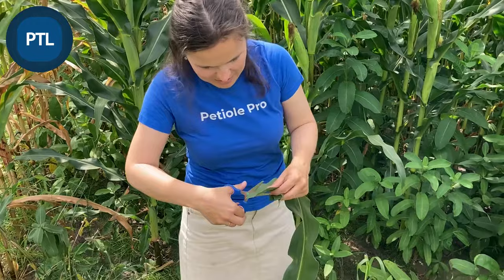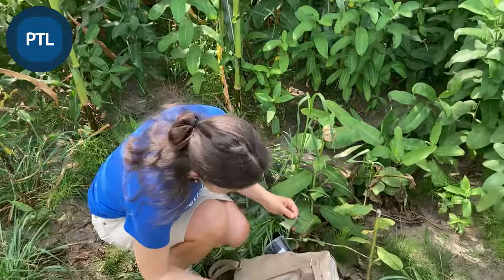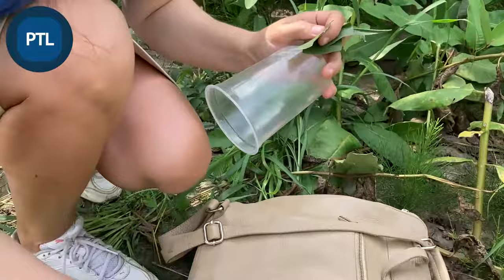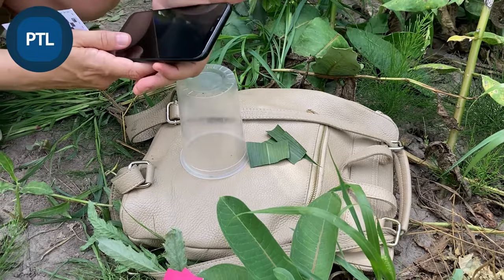After cutting, I put the scissors back into the backpack — the backpack will be my base. Now I have this stand, which is a simple plastic glass. I switch on PTL, and here we have our PTL app. Then I press 'Leaf Area Meter.'